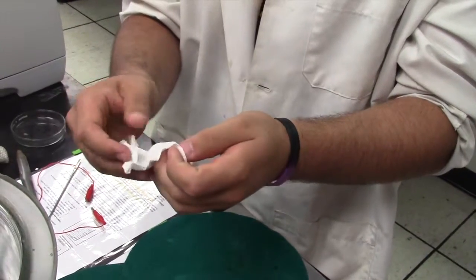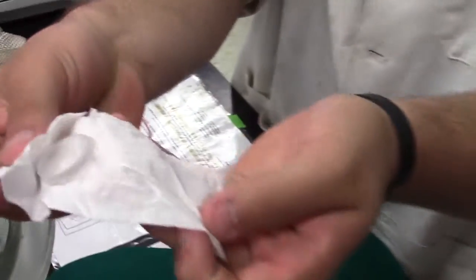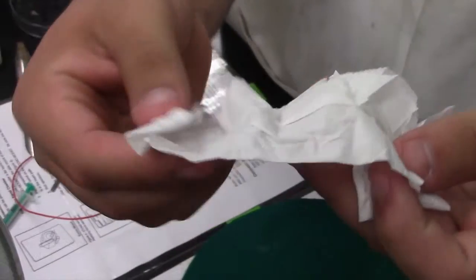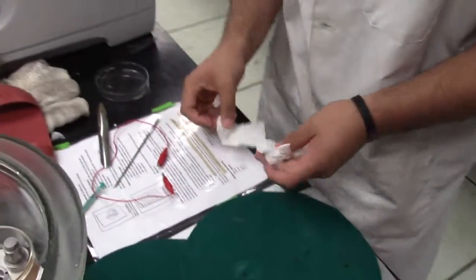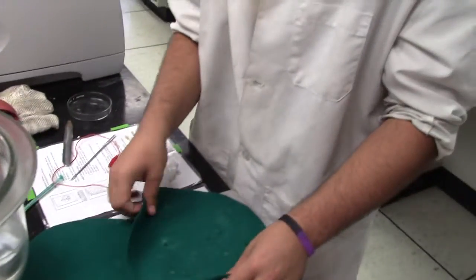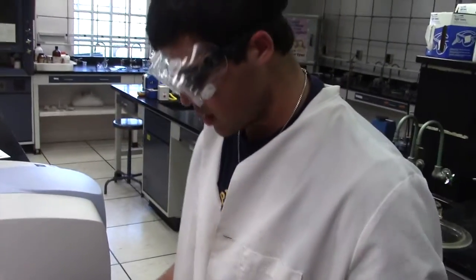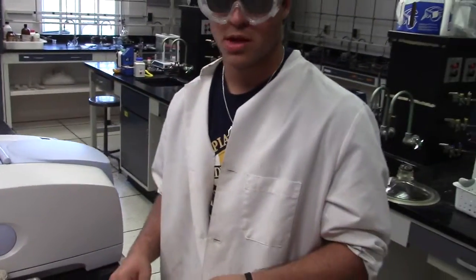And this right here is what we call a salt plate. And this right here is what we call the other salt plate. Now, I know you're thinking, I'm just going to put my product on there and put it in the IR. No, you're not going to do that. You're going to clean them first because we don't trust anyone else.